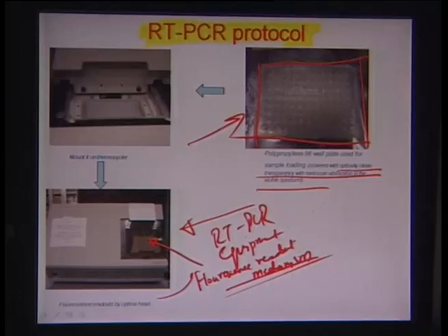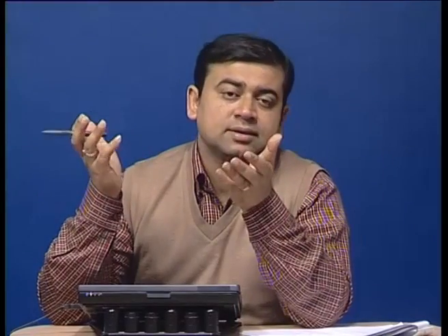These detectors have electronic channels from 1 to 96 which record data independently. Some channels can be just the reference without the sample, to monitor the background, and others can contain the sample.